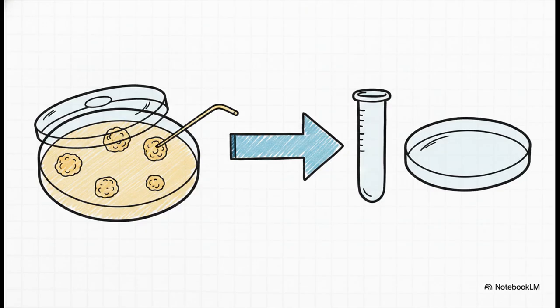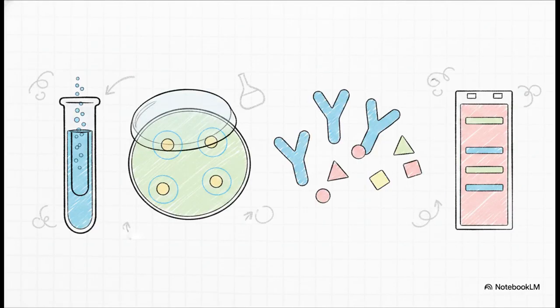Assuming you avoid those rogue dandelions and your technique is flawless, your next move is to create a subculture. This just means taking a very precise portion of cells from your perfect, isolated colony and transferring them into a brand new container of sterile media. Think of it as a backup file. This secondary culture lets you safely maintain and multiply your pure pathogens so you can run extensive tests without losing your original sample.